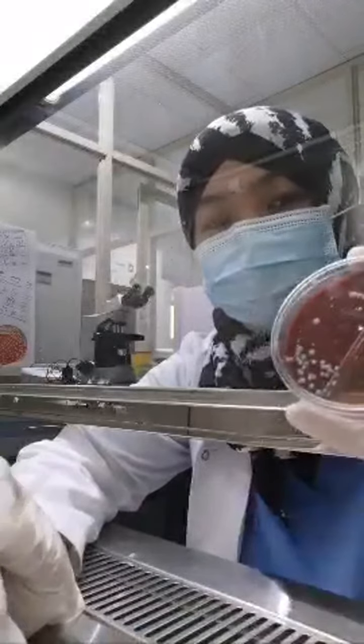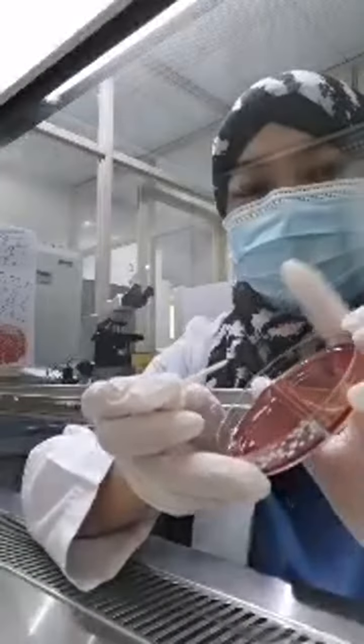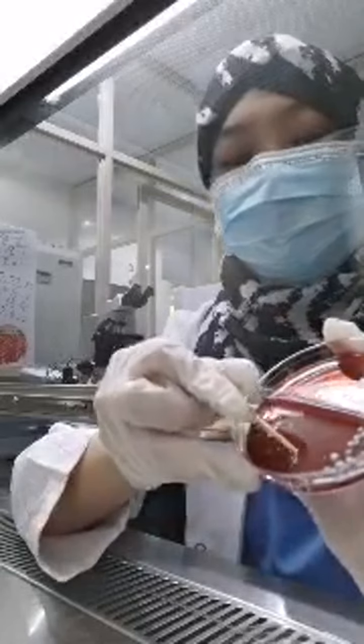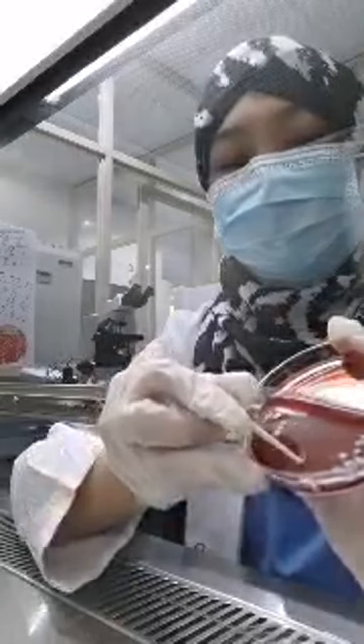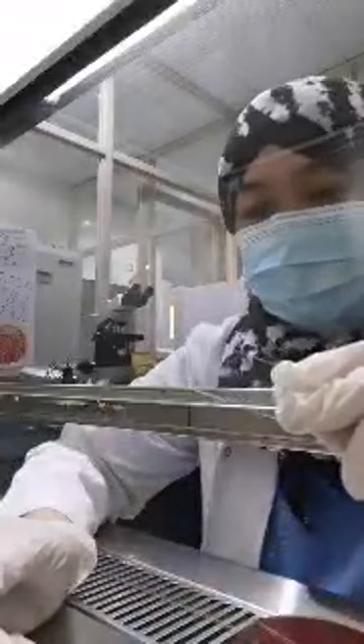Just get one colony, like for example this one. I will drop it and put it on the slide. So this one should have the bubbles.